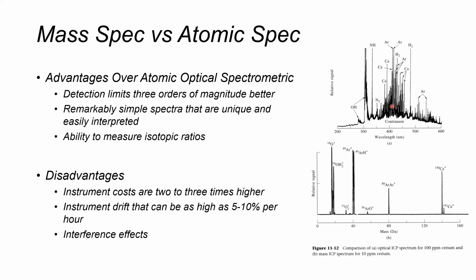So we can see a little bit of the comparison of spectra for optical ICP analysis and ICP-MS. So this might be ICP-OES or something like that. We can see the peaks are not very well resolved over the wavelength range measured. They are quite sharp, but the resolution here is not great, and it would probably be difficult to use this for any sort of quantitative measurement. Whereas we can see here at the bottom, we have an ICP-MS spectrum, and so this has much nicer resolution amongst many of the peaks, and it would enable us to use this both qualitatively and quantitatively.